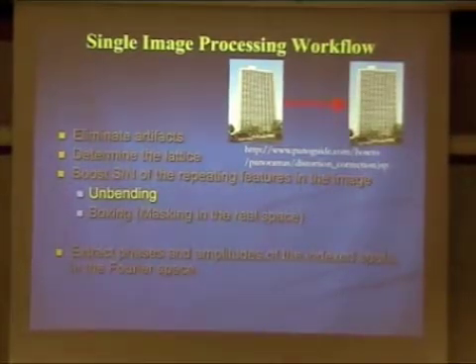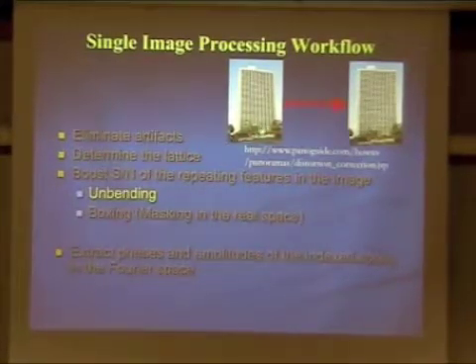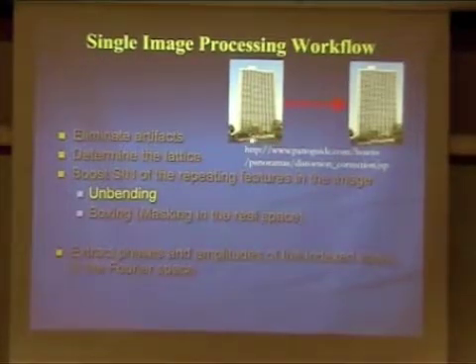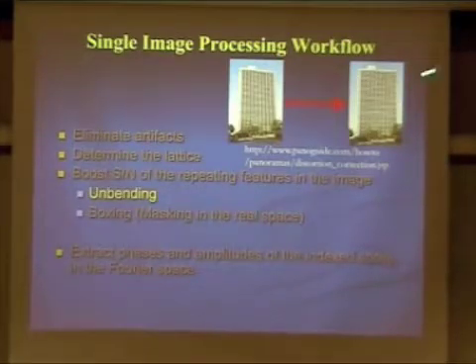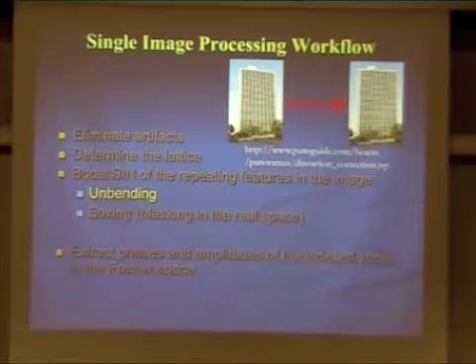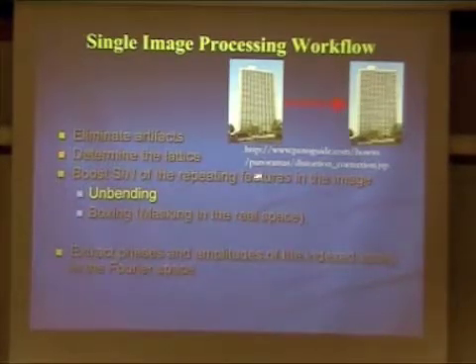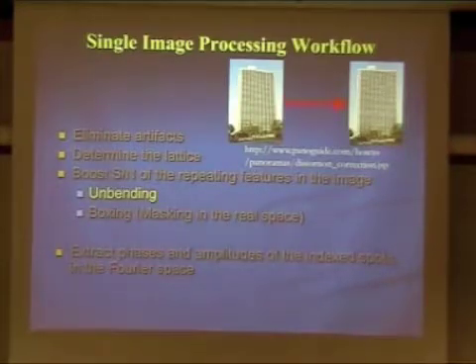So what's unbending? Unbending really is no different from what they do with a photograph. You have a photograph that you take from the parking lot of a building, and because of the perspective distortion, it will look like the top part is shorter than the bottom. So people develop software to undistort this part, and then you end up with the image like that. It's the same thing that we are doing here. There are several things that you need to do. You need to know the extent of distortion, and then you will be able to correct it.